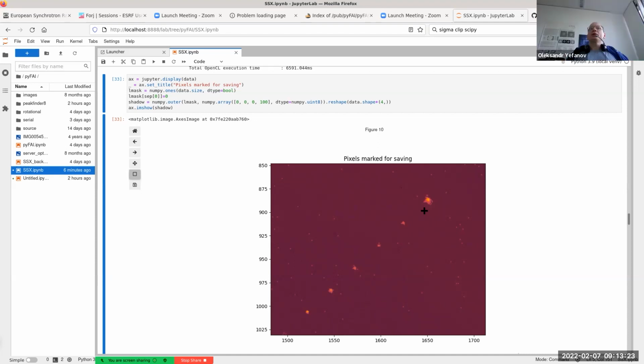And by the way, do you work with HDF5 files, or is this the raw native format of Jungfrau? Well, the guys who are doing the interconnect between the detector and who will manage the saving are working directly with the PSI API, and they are retrieving the raw buffers. So they are not reading HDF5 files.